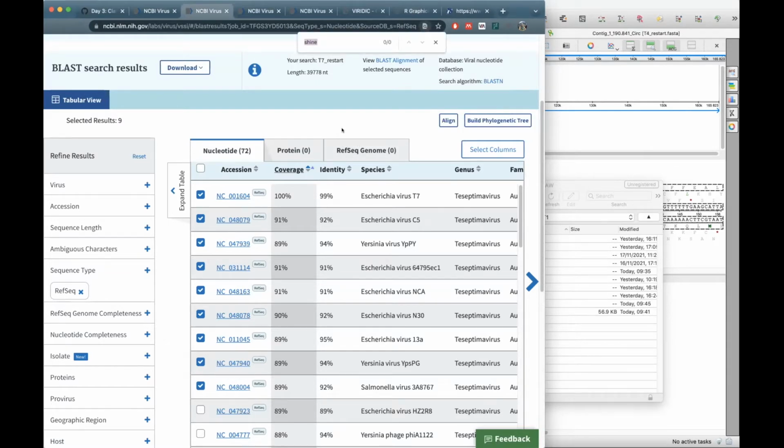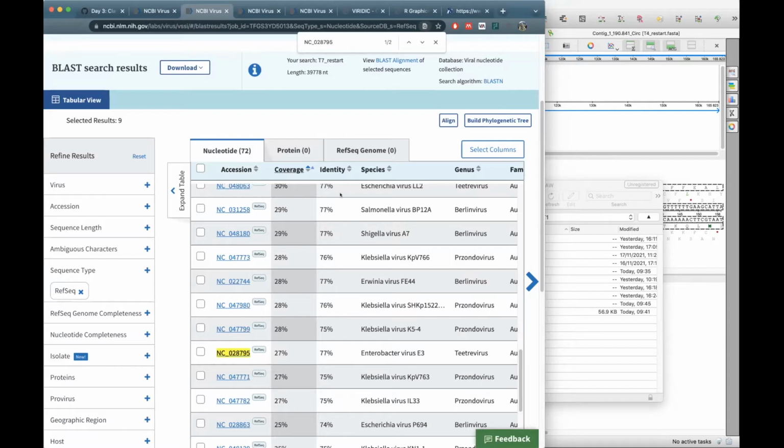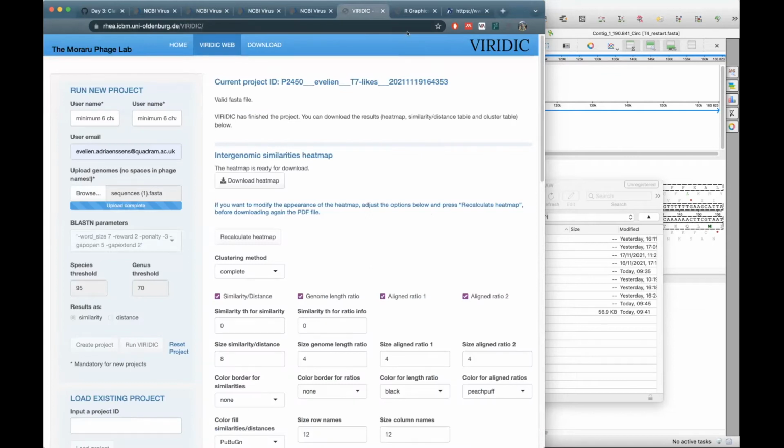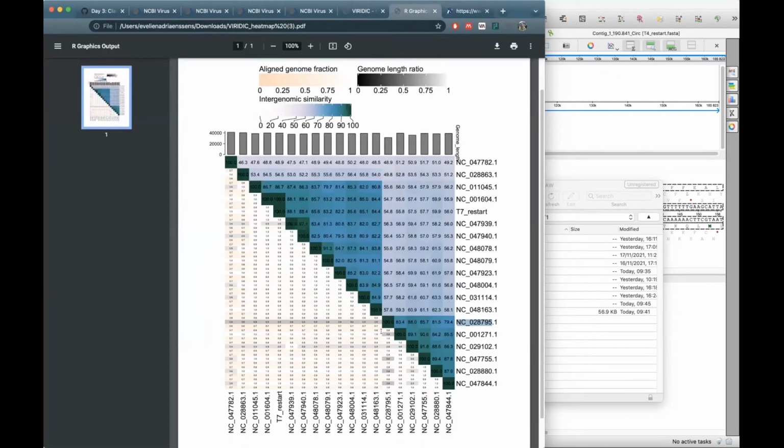Just gonna do, and look at this. This is actually a T3 virus. So different genus, great. And then we can see that these 2 are again more by themselves, but all of these are still genomically related, but not at the species or the genus level together.